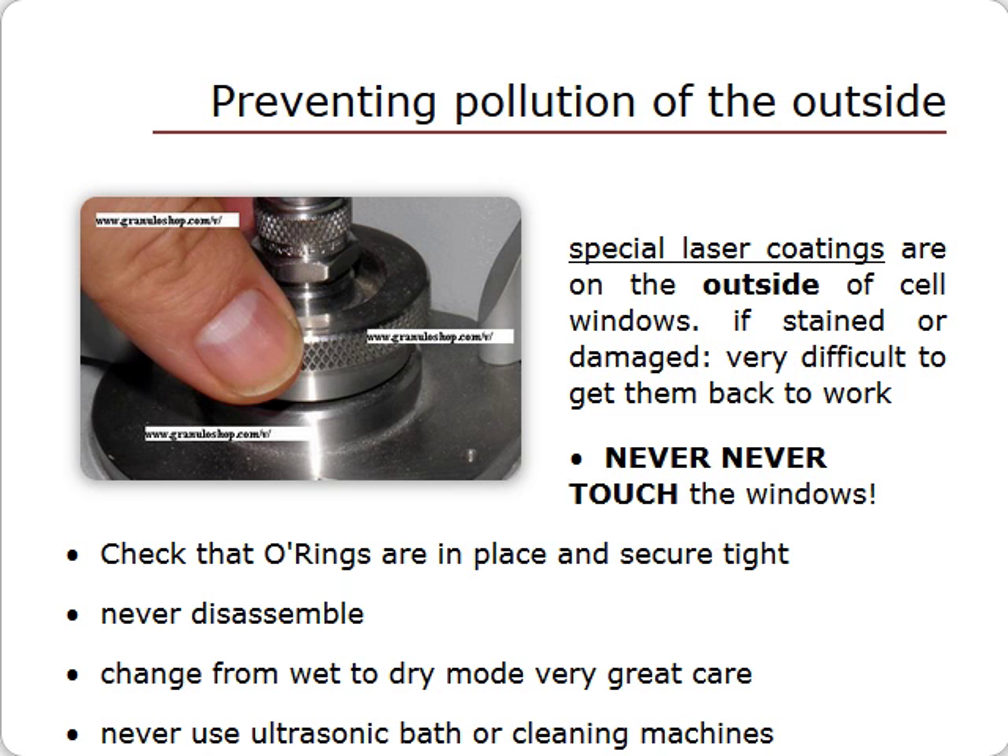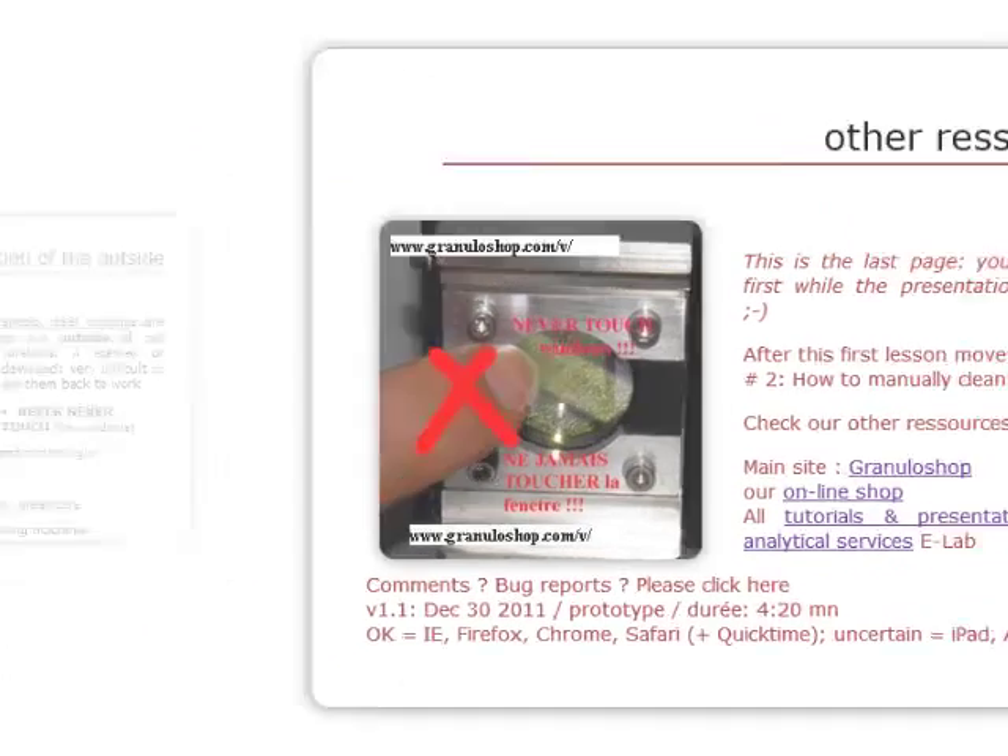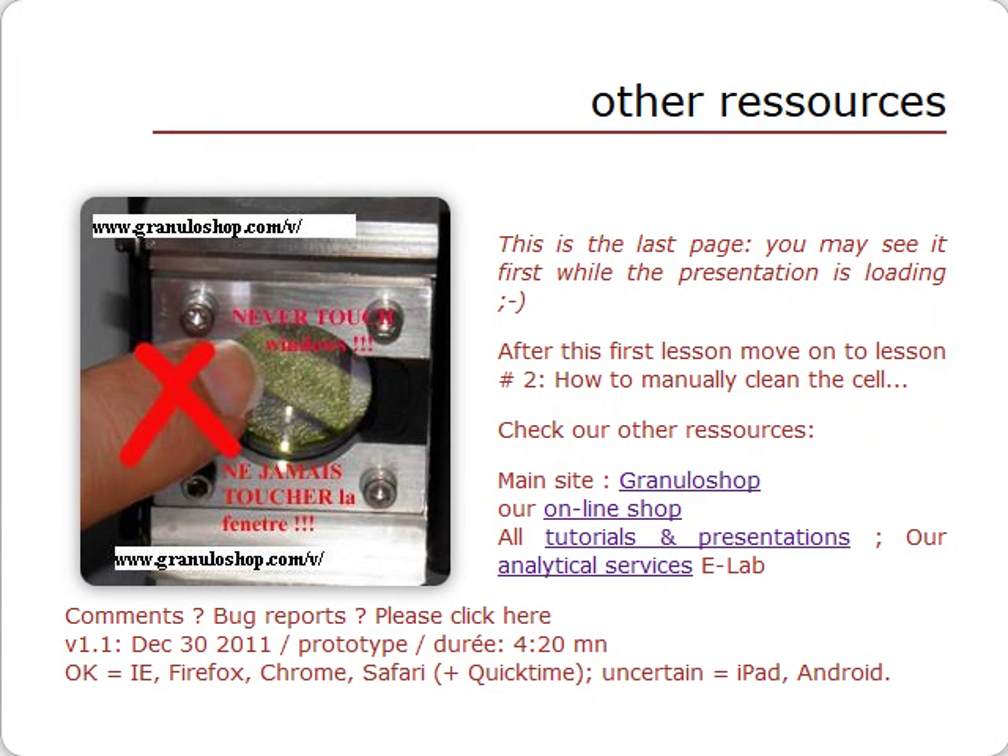Never attempt to disassemble the sample cell. Pay extra attention to what you are doing whenever you switch an instrument from wet to dry modes. Obviously, you should not attempt to clean the sample cell in a sonicated bath or a washing machine. Our lesson 1 on preventive maintenance of a laser particle size analyzer is now over. If you still cannot get a valid set zero, you will have to manually clean the inside of the cell — this will be our lesson 2.